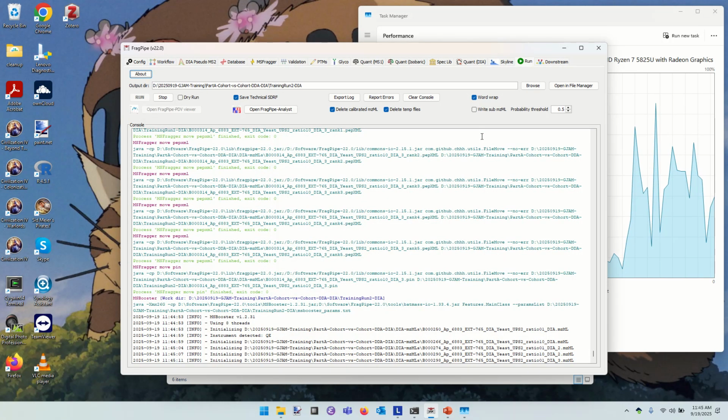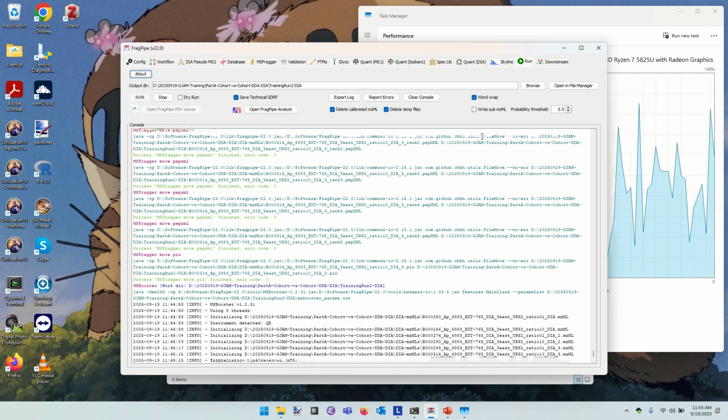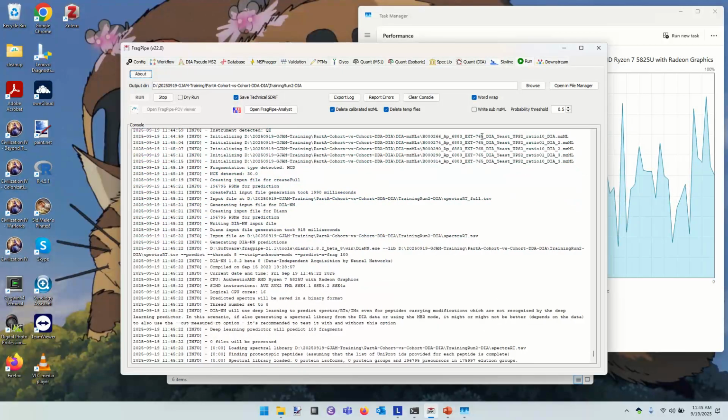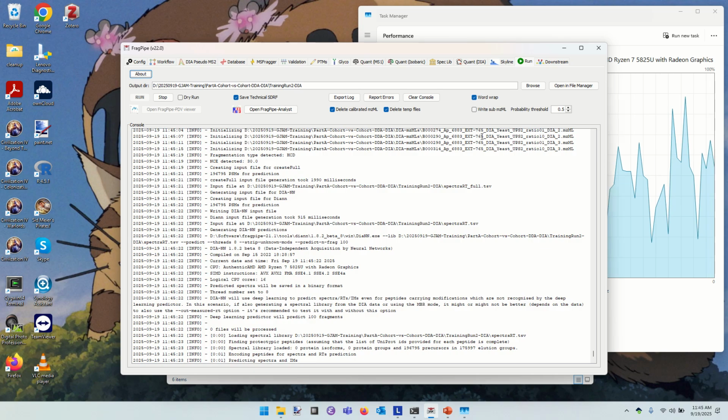Most of my opinions on this came from Mike McCloss. We crossed over when we were back in Yates Lab many years ago. If I had to pick a minimum number of peaks, I would probably say something like 7 measurements across a chromatogram is quite necessary to getting a decent peak shape, but I'd much rather have a dozen.